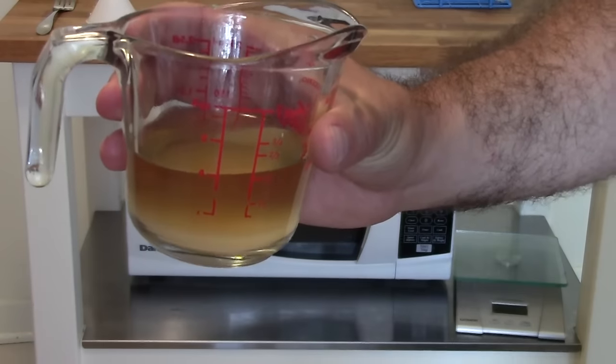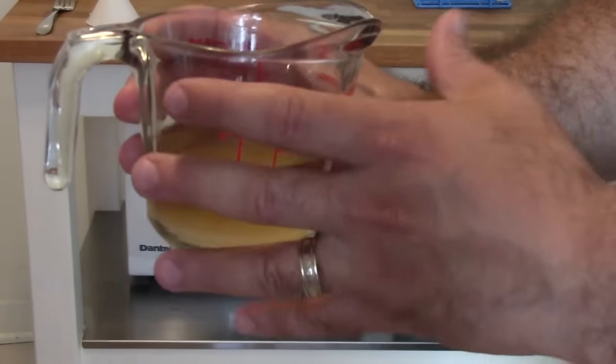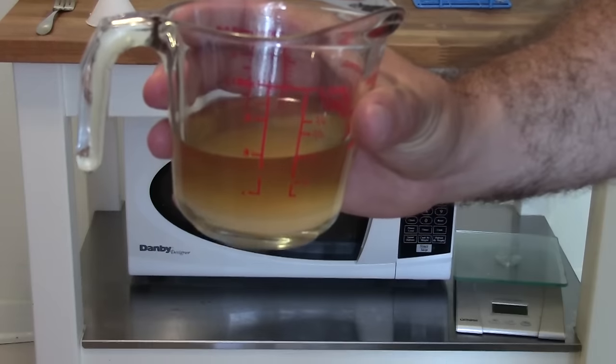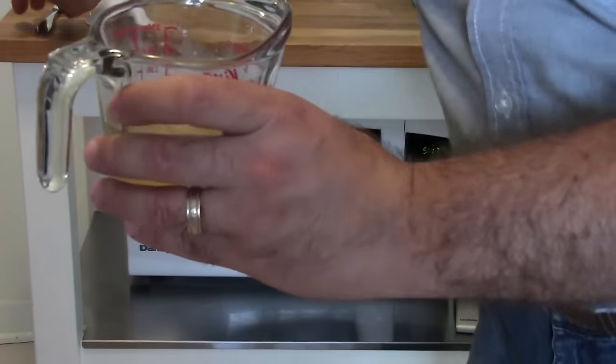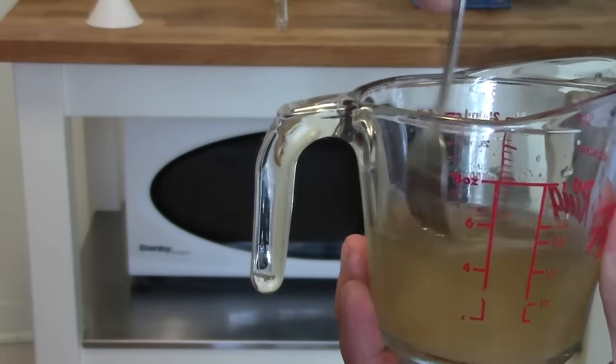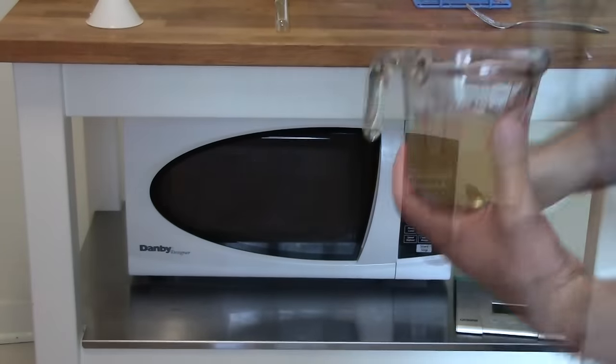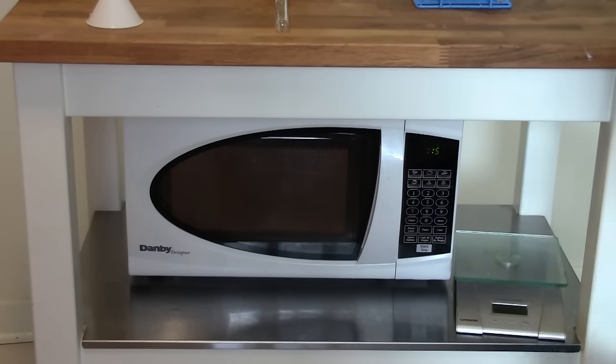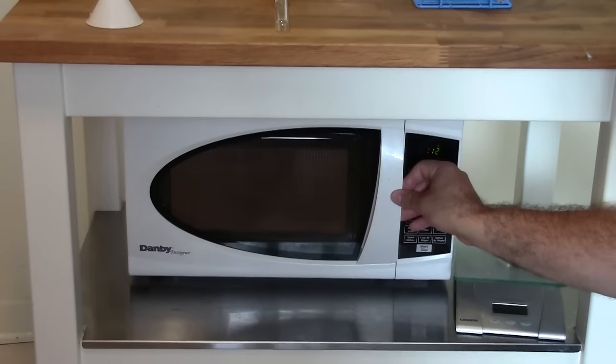So the first thing we're going to want to do is dissolve the agar into our media so it's all ready to go. Now we don't need to boil this extensively. We're not trying to sterilize the media or anything like that. We just want to dissolve the agar. So an easy way to do this is to stir it up and then just pop it in the microwave for a couple of seconds. Now I don't think you can see this on the camera, but basically what I'm doing is I'm trying to look into the microwave and the second I see any sign of boiling, I'm going to stop the microwave, bring my measuring cup out and give it a stir. I'd also recommend doing it every 20 or so seconds otherwise that agar may settle and give you a solid layer at the bottom.